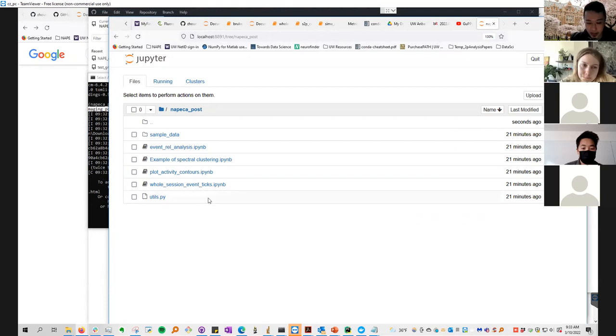The format of this, I'll show you, is in the form of a pickle file with containers that represent the different trial conditions. So let's say we'll be working with a session where the animals were administered, on different trials across the whole session, sucrose that was paired with a CS plus tone, and then no sucrose, which was paired with a CS minus tone.